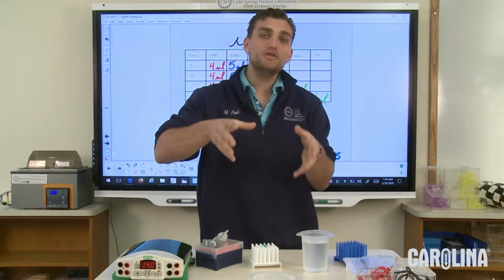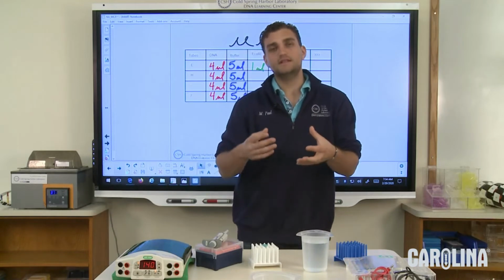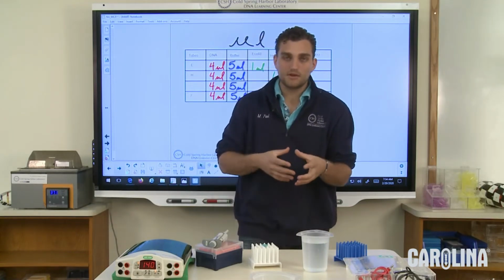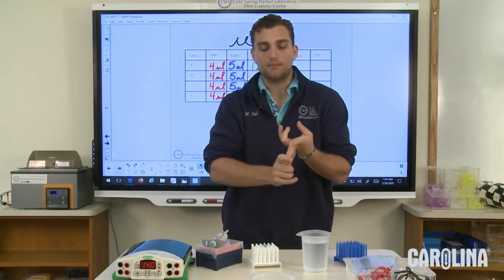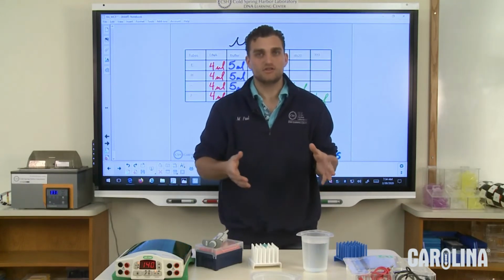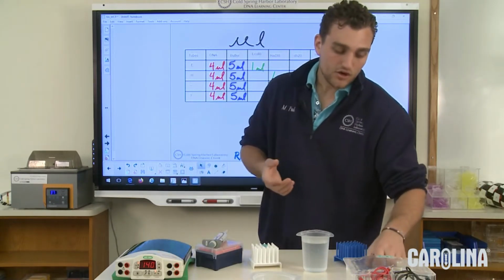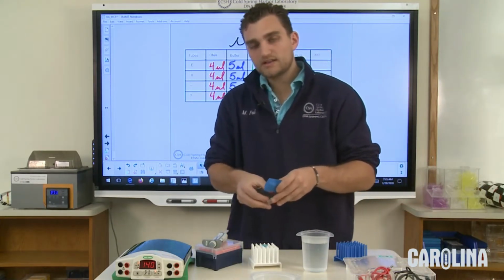And what we do is we put this sugar into an ionic solution. The solution is called TBE. This is a mixture of Tris base, boric acid, EDTA, and NaOH. Basically, it's just an ionic solution. It's going to help conduct electricity, which you'll learn why that's so important as well. So to make our gels, it's kind of like making Jell-O.